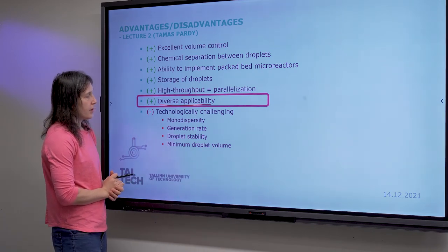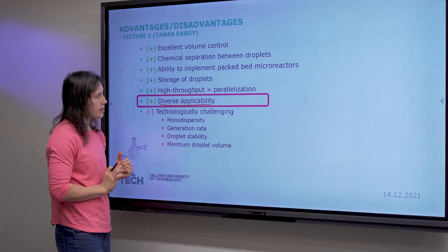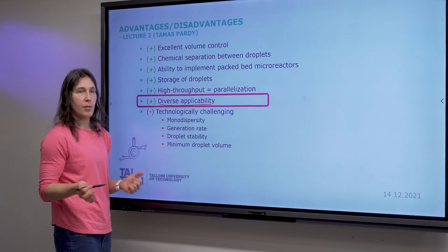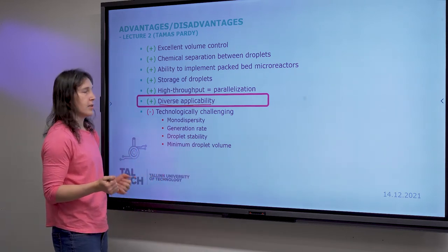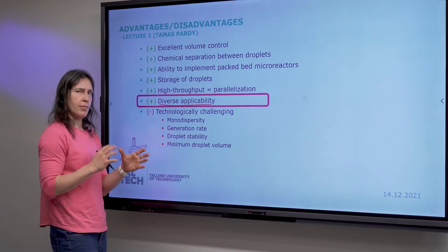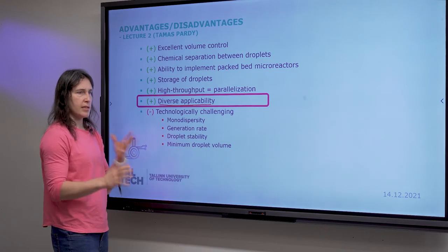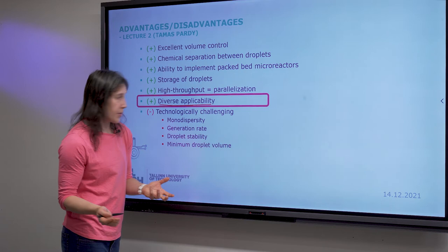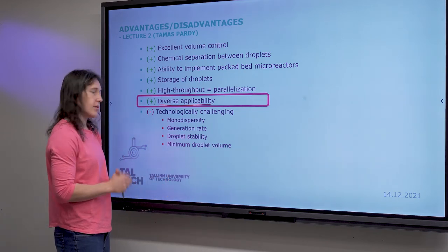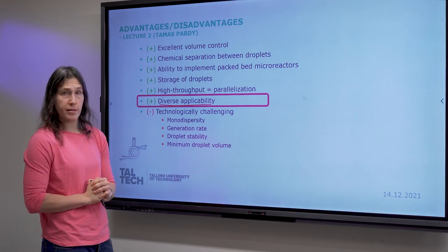But of course, there are also some disadvantages. Creating droplets can be technically quite challenging, also to get them mono-dispersed, if you want that. Also to find a proper generation rate, stabilize your droplets, and also the minimum volume of the droplets.